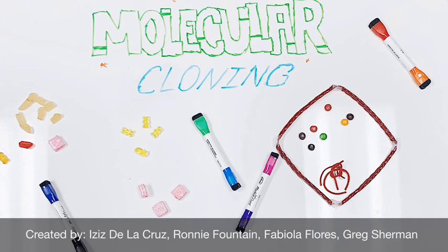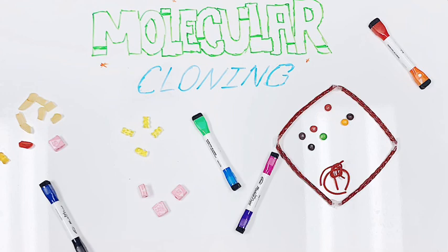Molecular cloning. Molecular cloning refers to making numerous copies of DNA fragments of interest, such as a gene. Molecular cloning is a set of techniques to insert recombinant DNA from a prokaryotic or eukaryotic source into a replicating vehicle, such as plasmids or viral vectors. Techniques to be discussed will include plasmid purification, restriction enzyme digest, DNA ligation, and transformation.